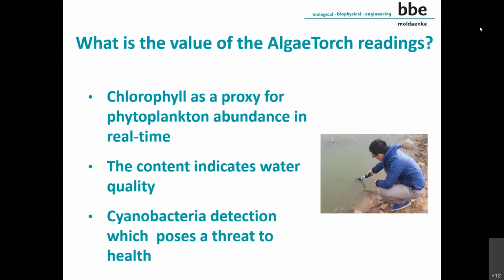So the value of this AlgaeTorch reading is that it can be used as a proxy for the phytoplankton abundance in real time. And it gives you the information that is needed for understanding the quality of the water.